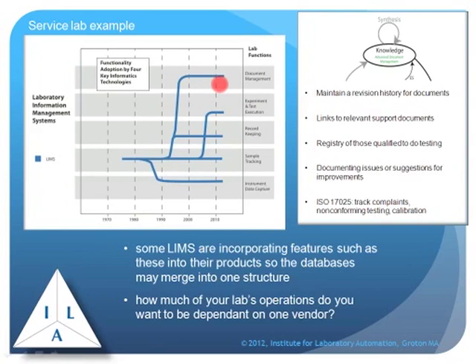So all the things that we talked about in the knowledge database can be taken care of by the LIMS systems. One of the questions that you need to deal with is how much of your laboratory do you want focused on one vendor? How much do you want to have your laboratory really controlled by one vendor's set of products? That may provide a better means of integration, but it doesn't mean you're going to get best of breed.